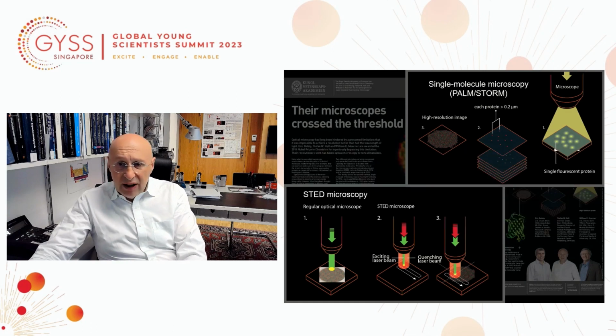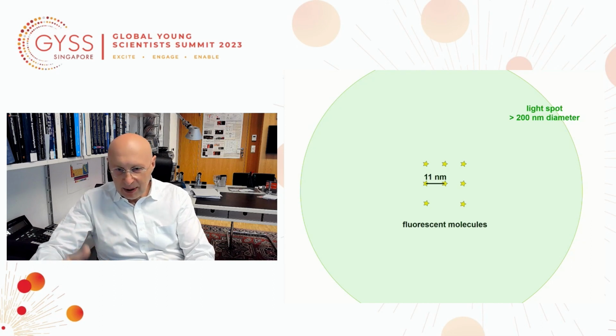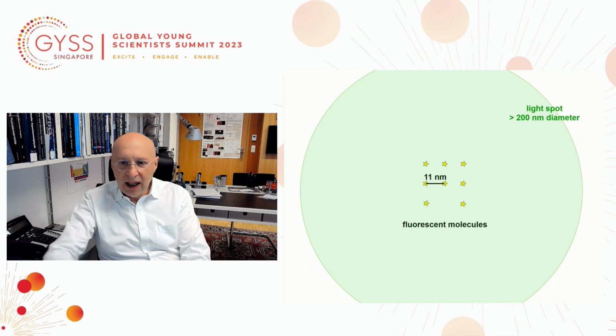Now, in order to get there, of course, you have to understand what makes fluorescence nanoscopy, or super resolution fluorescence microscopy, some people call it, tick. And in order to explain this to you, I'm preparing just a few slides. So don't worry if you didn't understand how the principles of these methods come about. I'm going to explain it now, and don't worry about it.